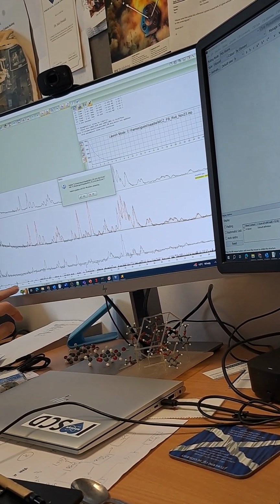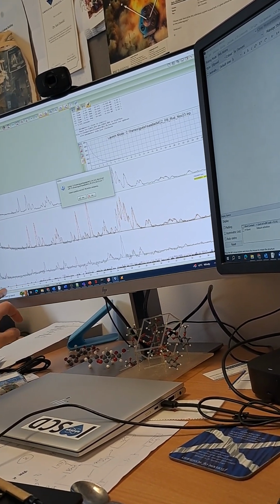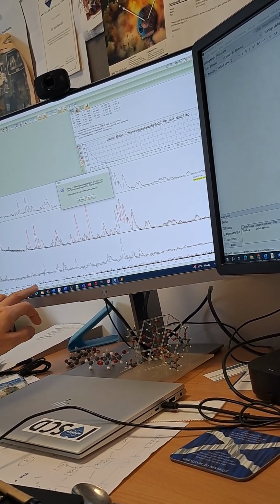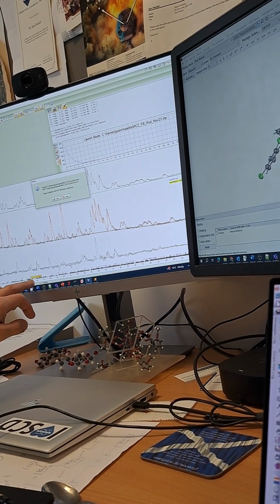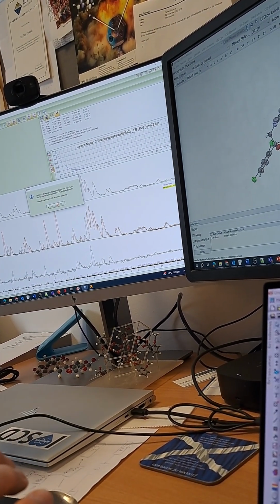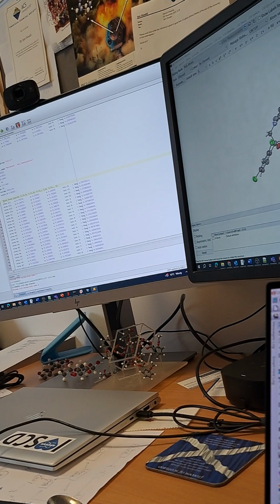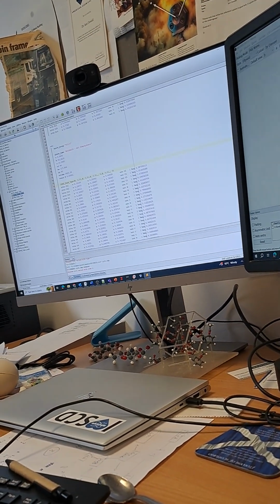Okay, and this one, there may be a combination of them both in there. If we look a little bit, we could have this one in here, this one in here. If we look down, this one maybe in here. So these two in here. Okay, so we're really quite close. We're not too far away. So let's try and see whether we can do this trick again. Okay, and I'm going to go and put in my function here. Peak shape.